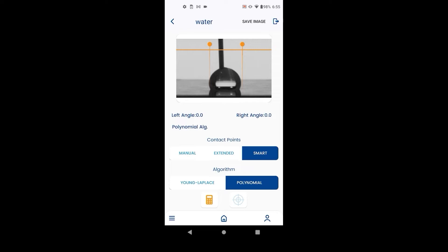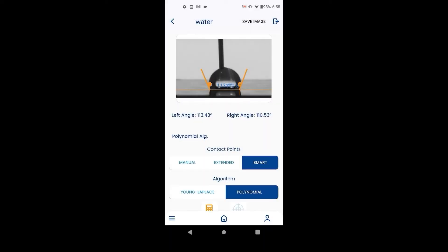The default method is smart contact points. The user only needs to provide an estimate for the baseline and left-right contact points, and the system then auto-detects the exact contact points. When selecting the baseline, be careful not to mistake the droplet for its reflection — this can be a problem with contact angles around 90 degrees. Hit calculate once everything is in position.